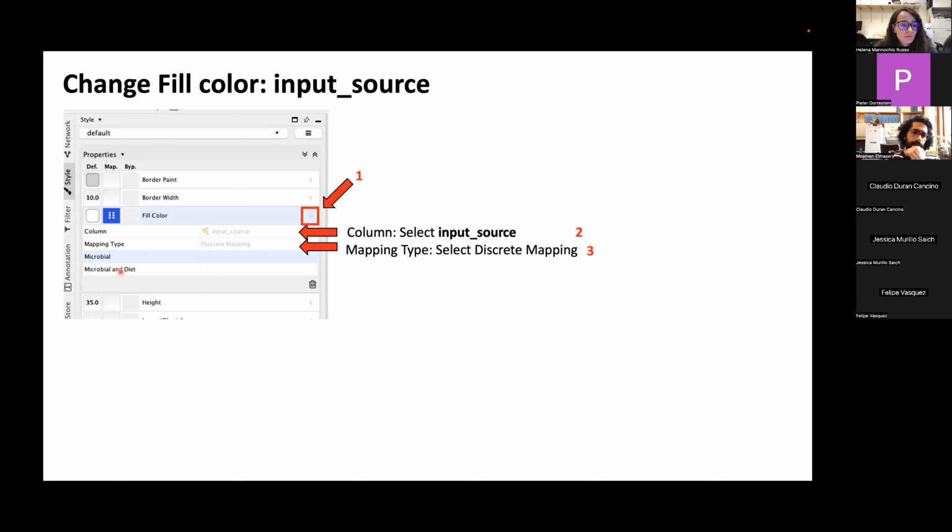So we do try to capture that, and the reason why this is nice is because if some of the microbial metabolism or metabolites are not a part of standard metabolic pathways, you need to start building new metabolic pathways, and that would permit that. So the precursor substrates are documented if people upload that, and then the products of those reactions are documented. Okay, thanks. Yep.